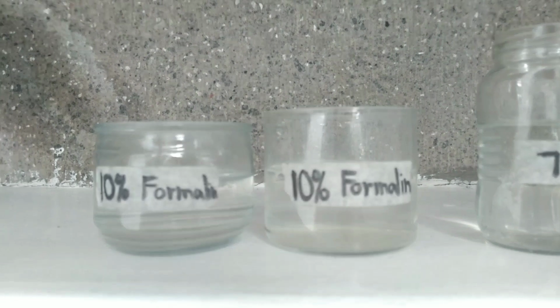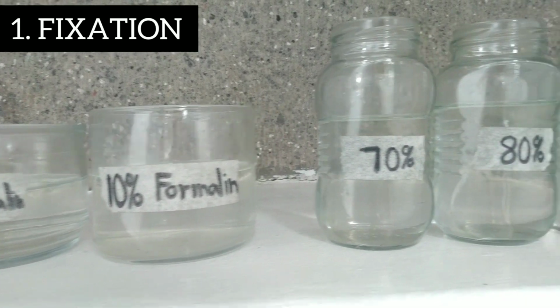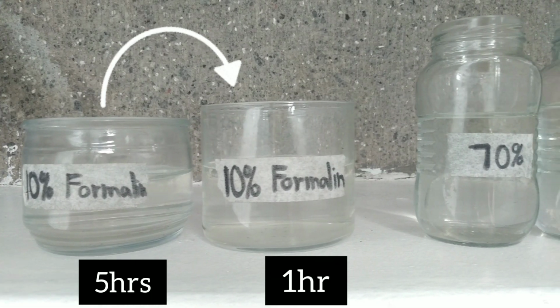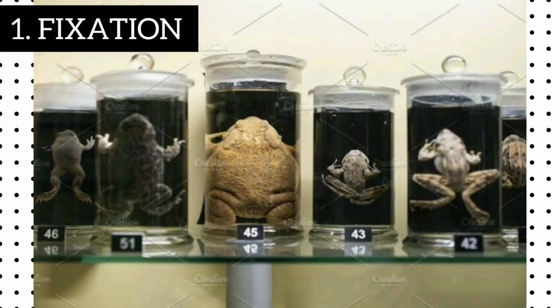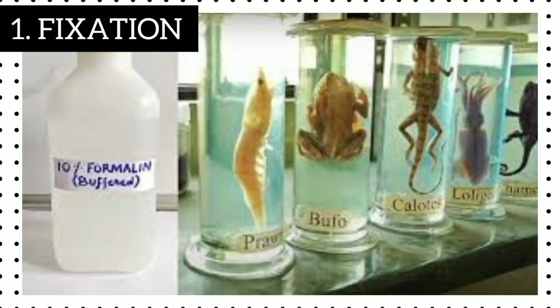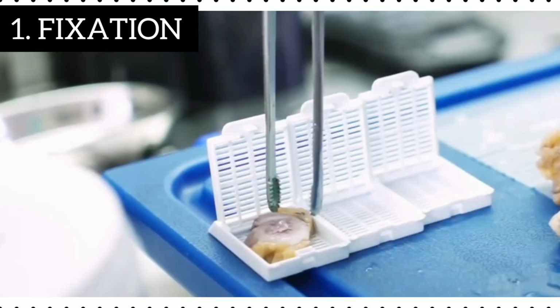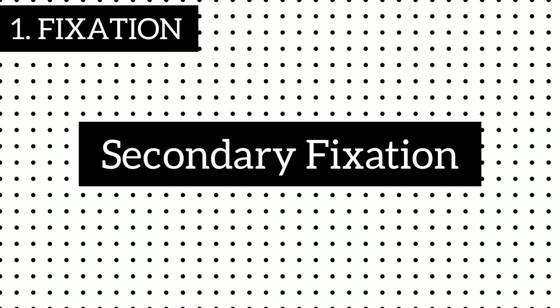The first step in tissue processing is fixation. Fixation is the process by which cell and tissue structures and chemical components are preserved in a lifelike manner to prevent decomposition and autolysis. It involves terminating metabolic processes, penetrating individual compartments, and hardening of tissues. There are cases wherein a specimen needs to be fixed twice. Thus, the process is called secondary fixation.